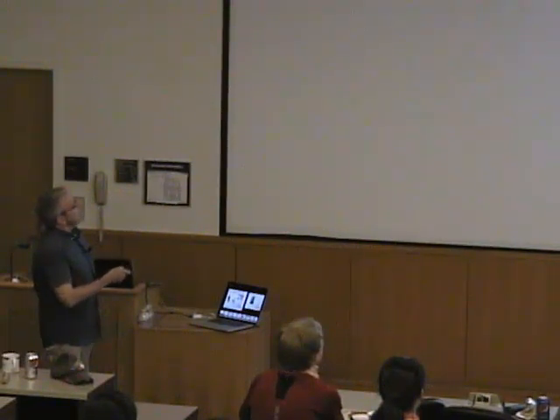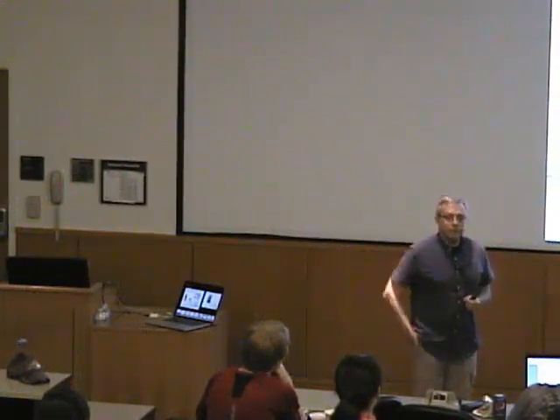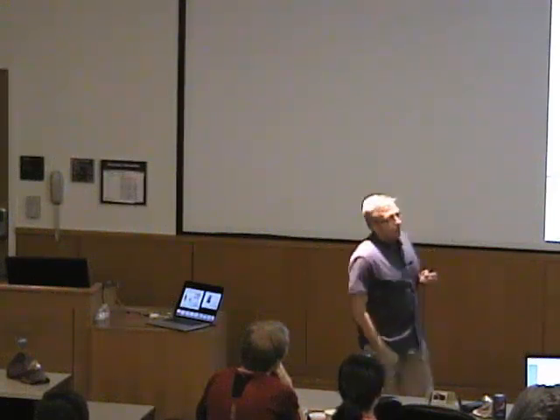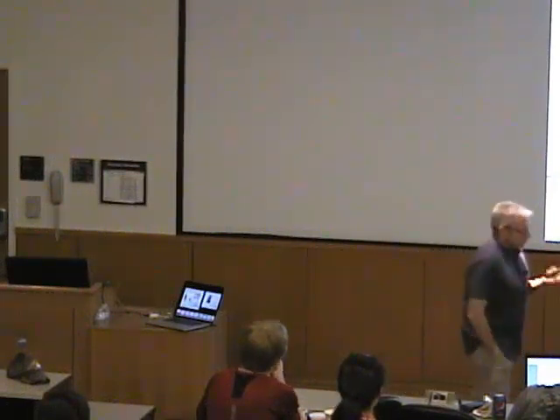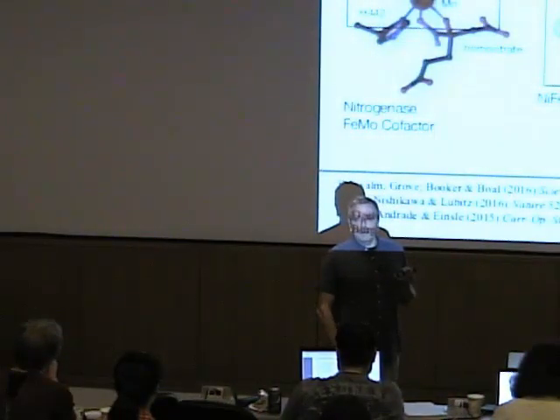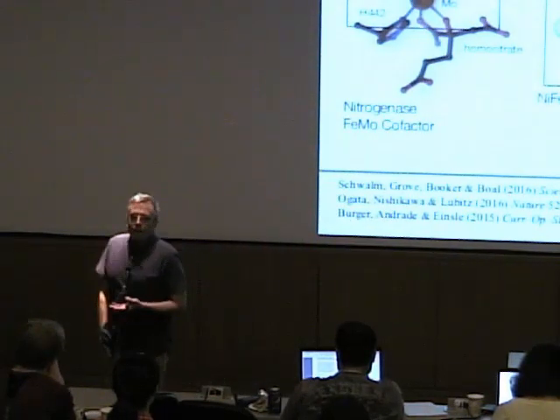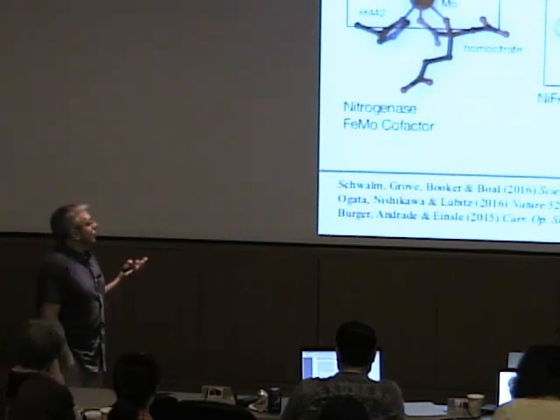Because first, I wanted to mention why we actually care, because an important point that you also see from electron microscopy is, of course, if you don't reach a sufficiently high resolution with your system, you may still get quite an information on how a protein chain is going, how different subunits of a molecule interact, and that's all valuable information. But it's information that doesn't help us very much in bioinorganic chemistry, because we obviously care not only about mechanisms, and we don't only care about chemical questions, but we care about systems that are in many ways non-canonical, that are systems that you will not be able to describe based on a library, that are systems that people, in fact, haven't seen before.